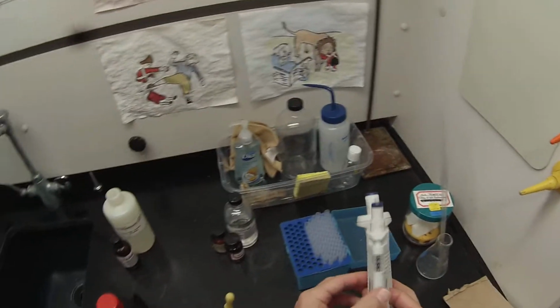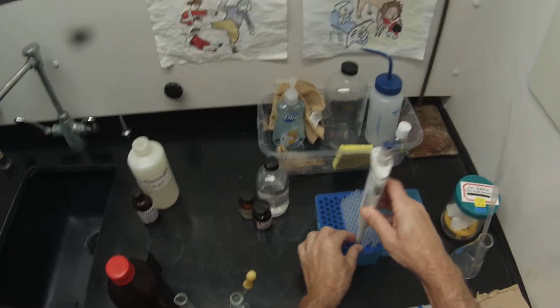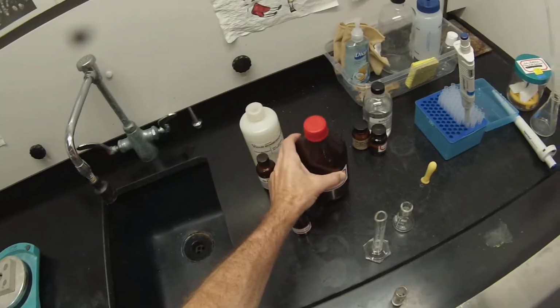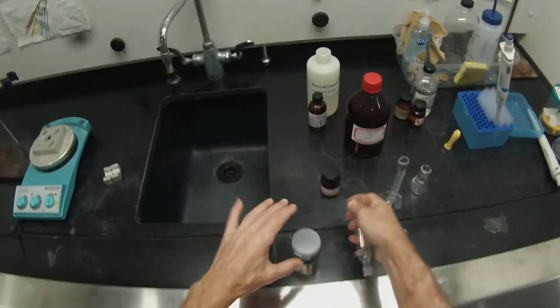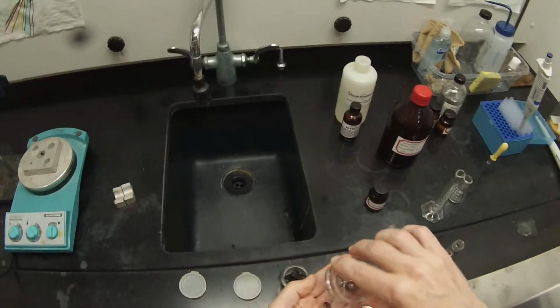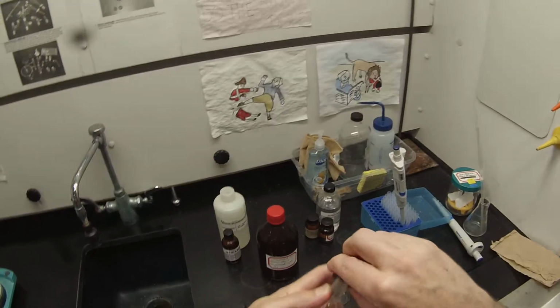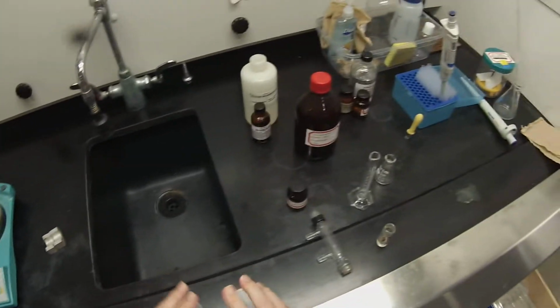And then we need an automatic pipetter that's set at 913 microliters. So this one is set at 913 microliters for dispensing the butanol. This other pipetter is for the 2-butyl alcohol reaction. And then I need a condenser, and I need to put a cap on there with an O-ring, so that'll create a tight seal. The cap goes on, and then the O-ring slides on so it goes above the joint, and that way it can't come off. So when we attach it, the vial is held in place.